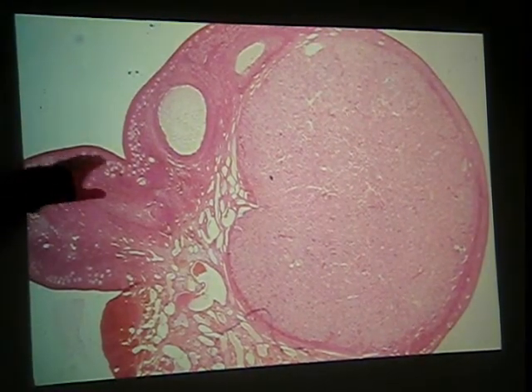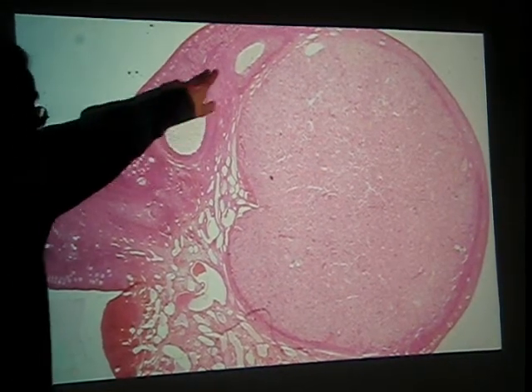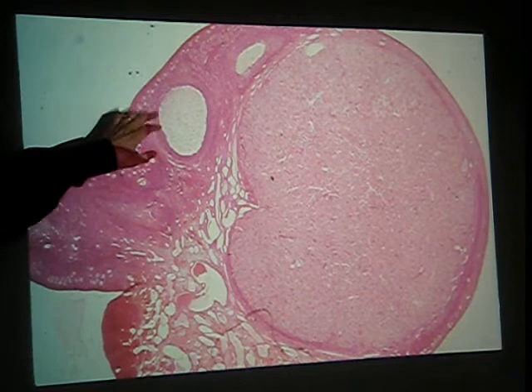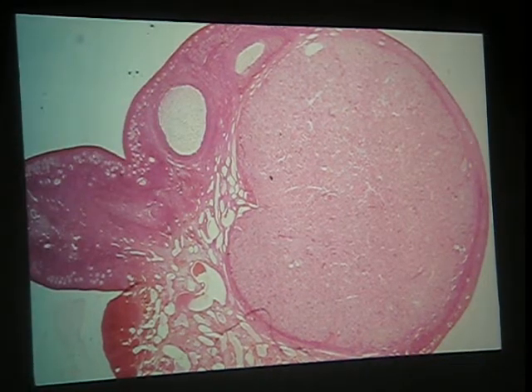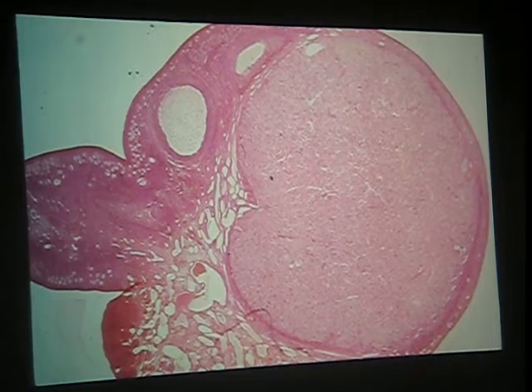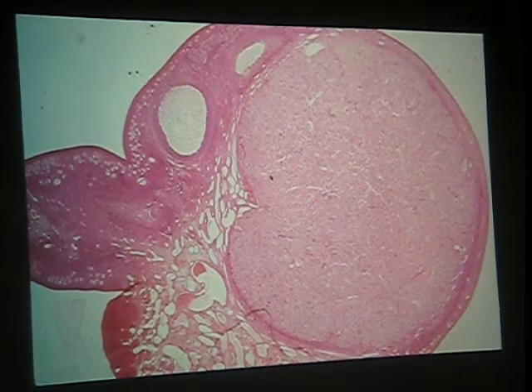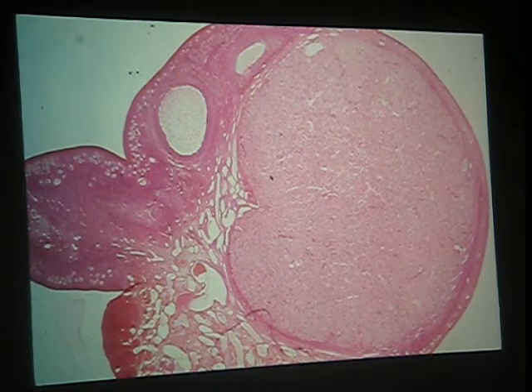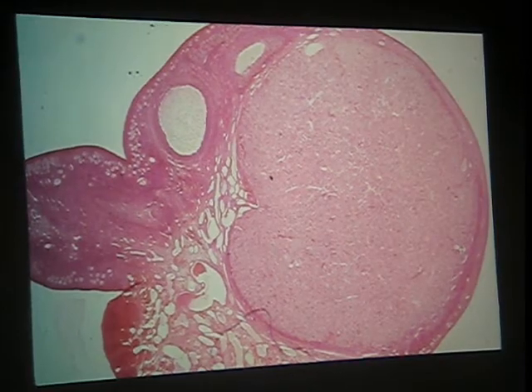Exactly. You can see a bunch of follicles, probably primordial, maybe some primary stuck in here. Secondaries, this kind of looks atretic to me. That you can tell, remember, at any stage, a follicle can die. And when something starts to die, the cells pull apart, the nuclei look a little funky, and that's probably what's happening right there.